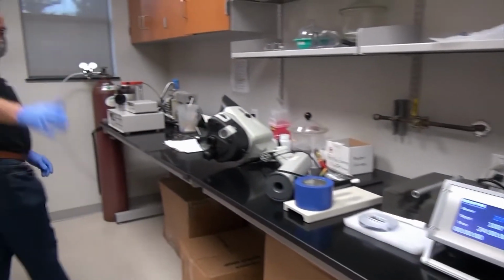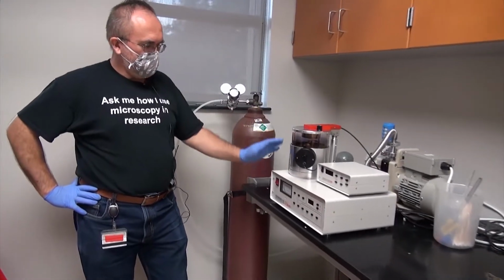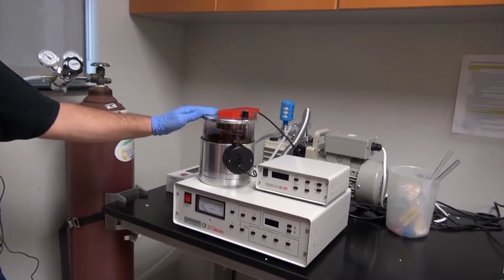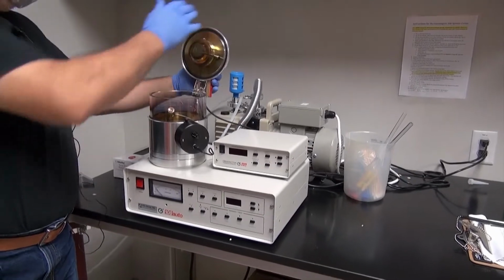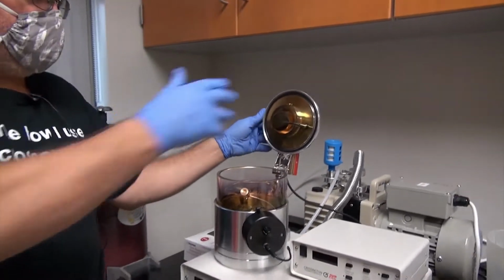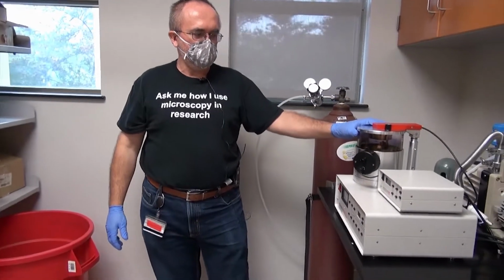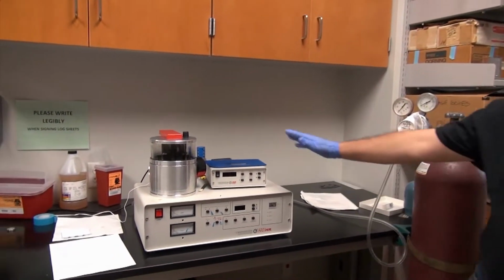And in addition to those, we also have some coaters. This is a Cressington low resolution coater currently equipped with a gold target. You can see the gold here. And this is to render samples for scanning electron microscope conductive and to achieve good imaging conditions.